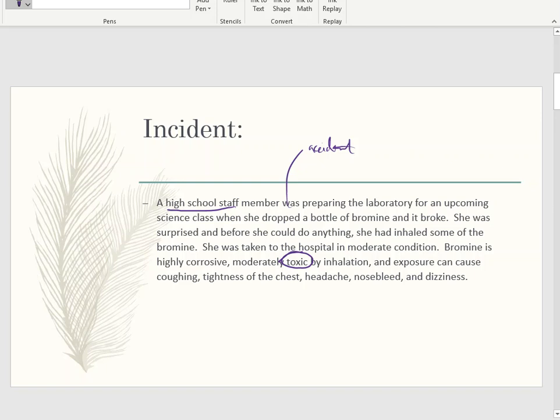Bromine is a liquid, but bromine goes into a gas basically at room temperature. So in the bottle, we get a liquid solution, and then as soon as you pour it into a beaker, this thing starts to turn into a gas, and it will fume, and it stinks. It almost has a very similar smell as a swimming pool in the middle of the summer. It's that disinfection kind of chlorine smell that people associate with liquid bromine.